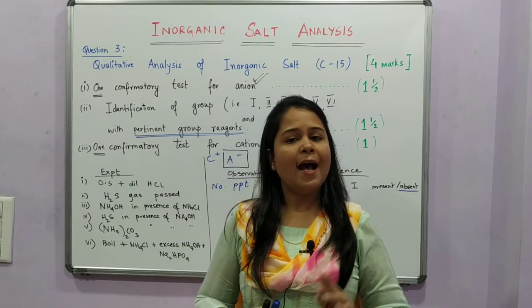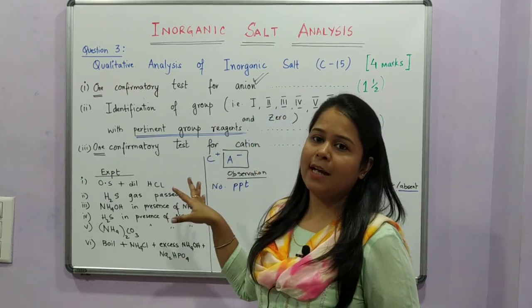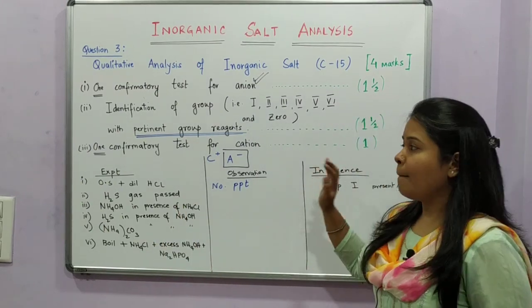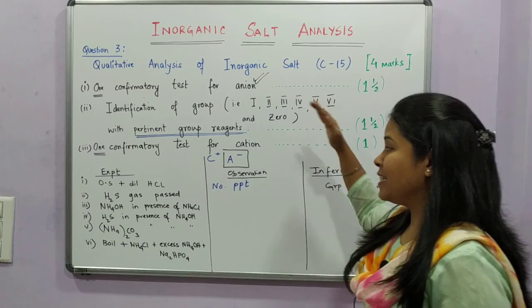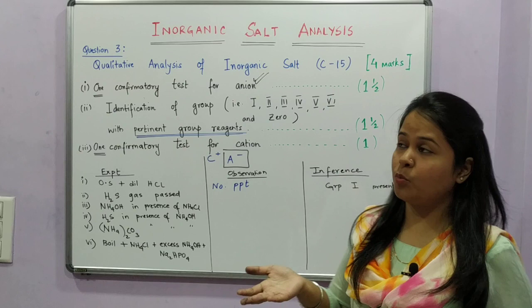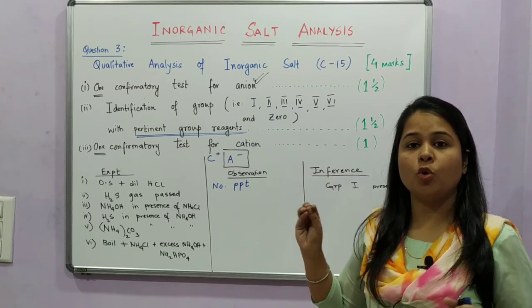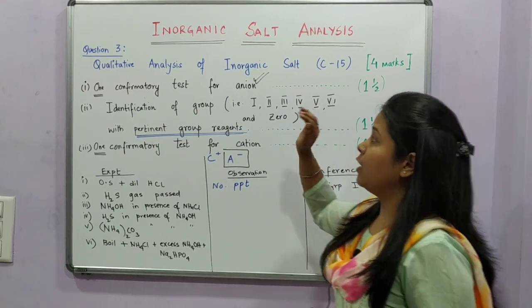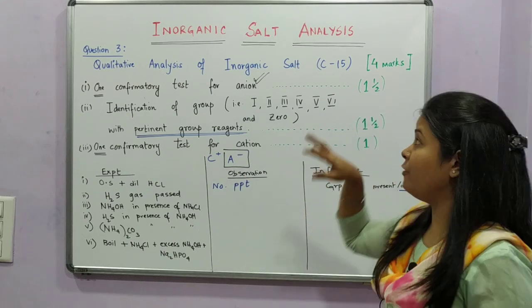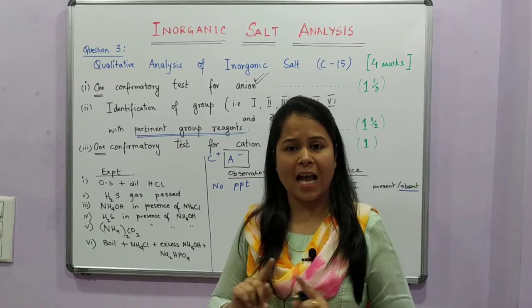This is mandatory. And the titration reading that we have already discussed, that part is already there. So for this inorganic salt analysis, the confirmatory test needs to be shown to the visiting examiner, and the very, very important part is the writing. These are the various marks divisions that I have just discussed with you, where you can focus, where you learn up well, and you know what is not to be missed out at all. Like the confirmatory test, the group reagents, the confirmatory test for the cation. These are the areas where you would be marked upon. So these points need not be missed at all.